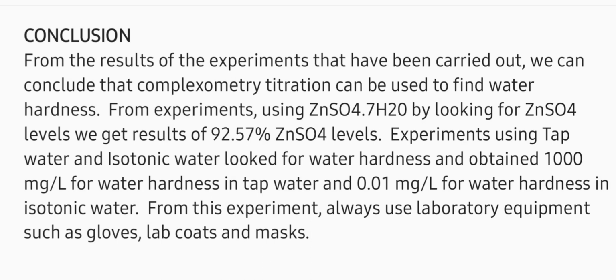Next, the conclusion. From the result of the experiment that has been carried out, we can conclude that complexometry titration can be used to find water hardness.